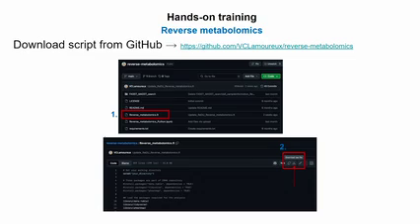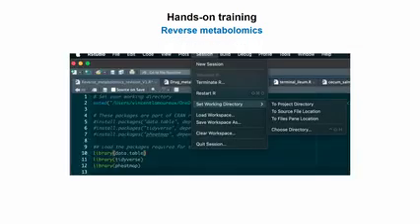So I think this part will probably be a little bit more challenging. So please don't hesitate to raise your hands. We have multiple people that can help you here. We try to make the code as easy as possible, but it's still coding, or a script, right? The idea is just to define 2 different directories, and then from there you can launch the code automatically, and it should run correctly and without any problem. But defining those directories is sometimes a little bit challenging, depending on your skill level. So please don't hesitate to raise your hand at this point. Did you all get the link to work, and did you download the script already?